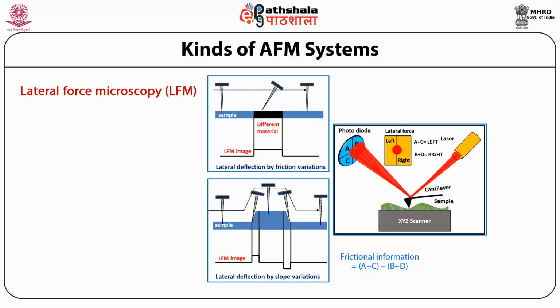The schematic of lateral force microscopy, LFM, is given in this figure. The LFM measures lateral deflections or twistings of the cantilever that arise from forces on the cantilever parallel to the plane of the sample surface. It images variations in surface friction arising from inhomogeneity in surface material.